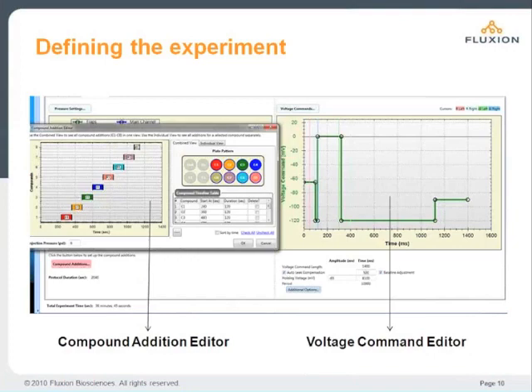After the first 4 minutes, where only the main channel is flowing, the compound from the C1 position, which in this case is simply buffer, will flow into the main flow channel and stream over the cells for 2 minutes. This will happen in all 32 experimental patterns at exactly the same time. As soon as the C1 application stops, the C2 application for 2 minutes begins. The C2 application will vary across the plate.